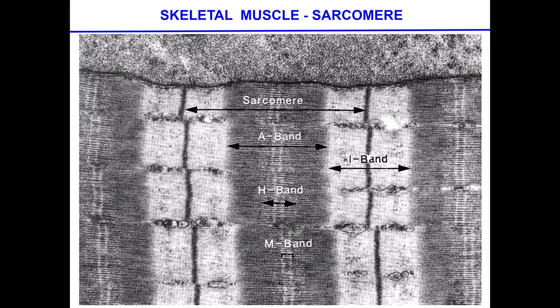This is a very nice, very organized picture of the structure of the sarcomere from Z to Z, with the A band that is primarily composed of, and given this darker, stronger density because of, the presence of myosin. Then the H band, which is this lighter portion inside, which has the M line right in the middle. You can distinguish these little things that constitute the M line, and that is where the myosin filaments are anchored.